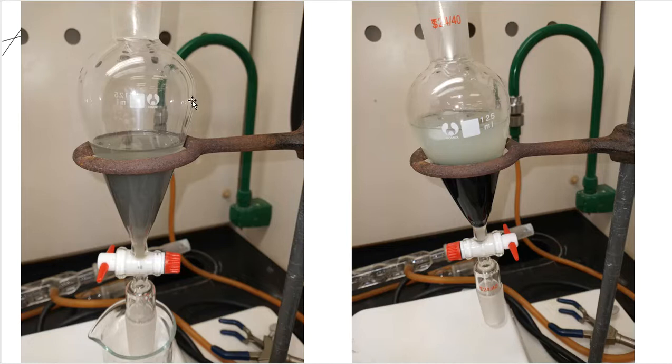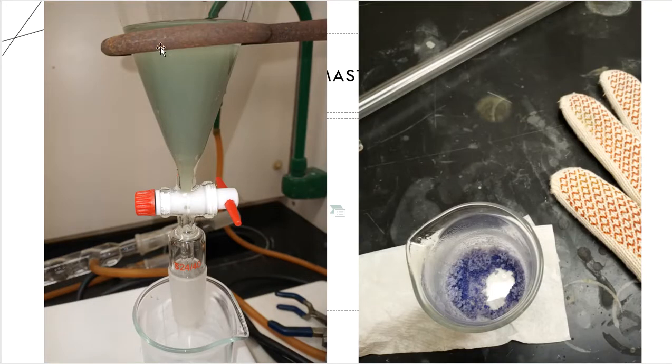Over here on the left-hand side is our first edition of a separatory funnel. I see some dark bluish gray color at the bottom with a smaller volume up at the top. In our next separatory funnel addition, we see a really deep, dark, almost black color at the bottom, and up at the top is more of a sagey green color. Finally, we put this back into the separatory funnel, and now we see more of a sage green, forest green color as far as the product goes. What you're seeing to the right-hand side is just the remnants of the salting out process taking place.